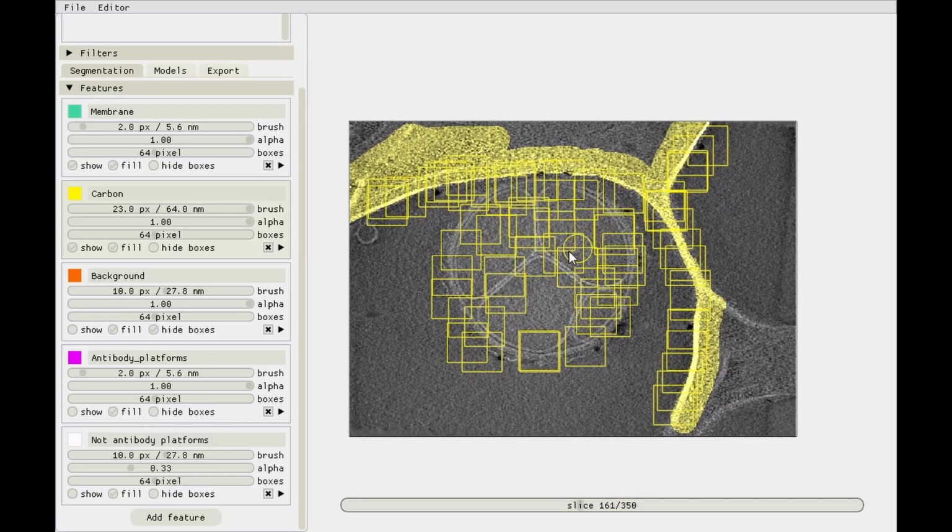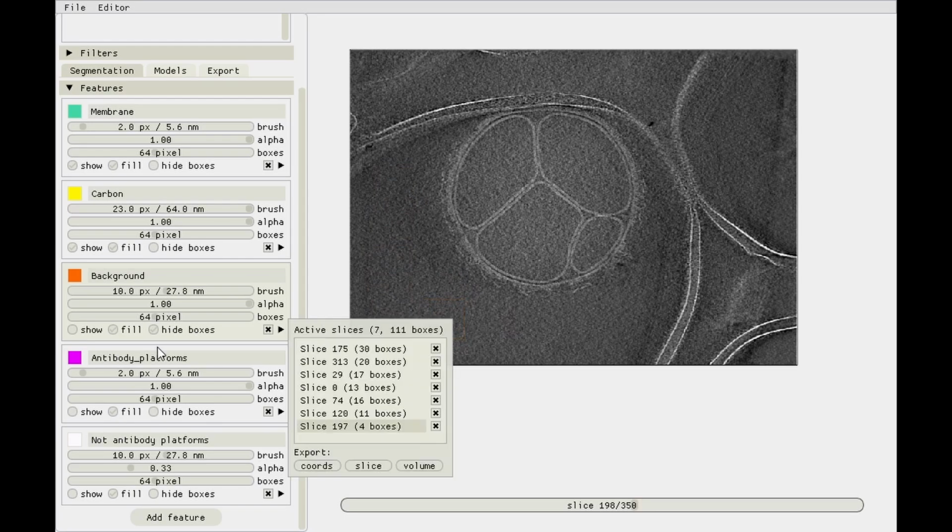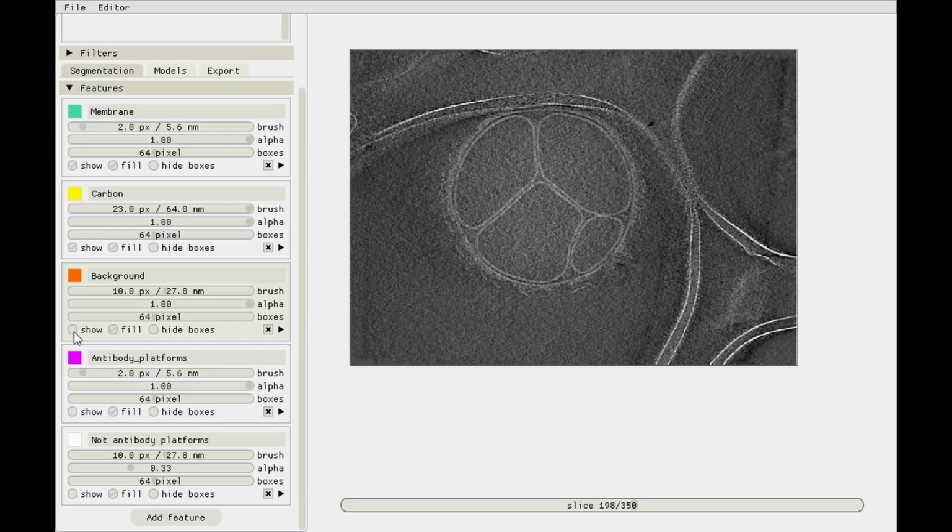So, done. Then let's pick some extra background images that will be shared between all the different models, so they'll all have just background noise essentially in their negative samples.